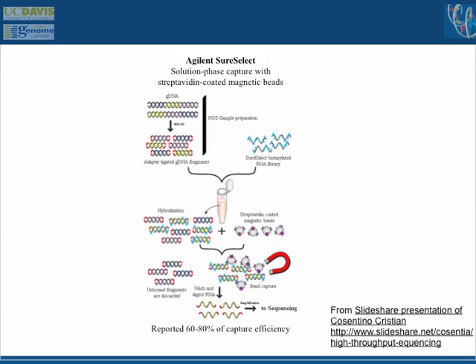Yeah, I mean, you can do it with PCR, right? If you have a conserved enough region between organisms. What you pick to do depends on whether or not you need haplotype structure recovered for some organisms, because PCR primers across a region lose the haplotype structure.